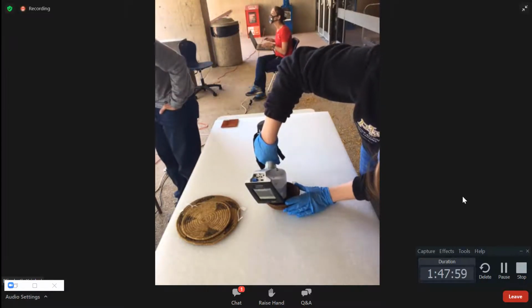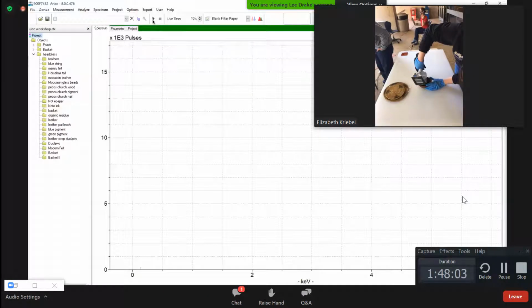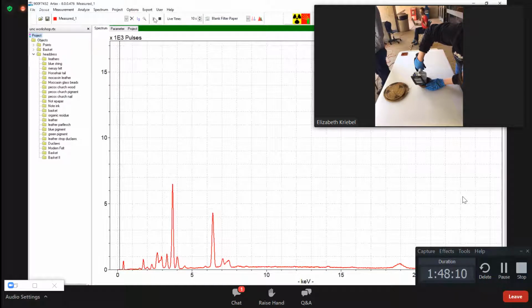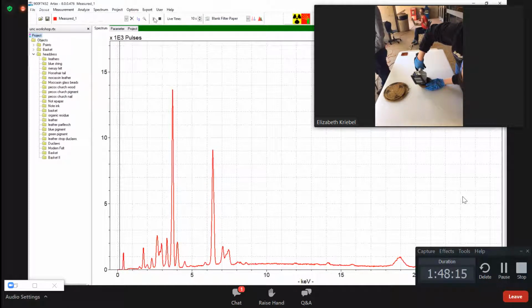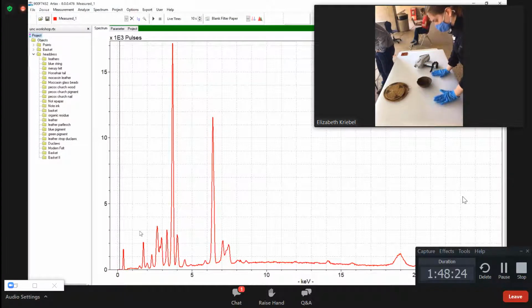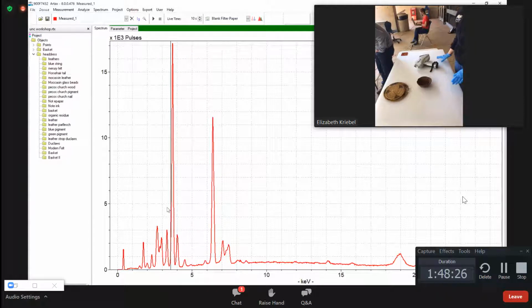All right, I'm going to share screen. Come back over. Ready? Yes. This one's a little different. Not a ton different, but a little. Got it. So I see some sulfur on this one, so there's definitely some kind of residue in there. A lot of silicon and aluminum. It's definitely a different manufacturer, and a ton of iron, but nothing toxic or of concern.